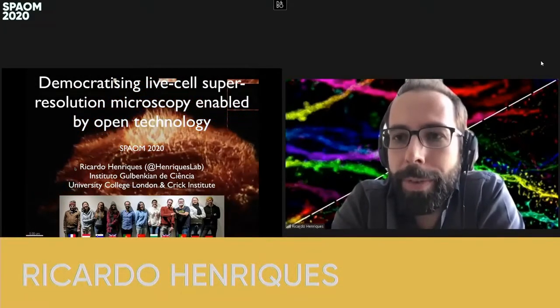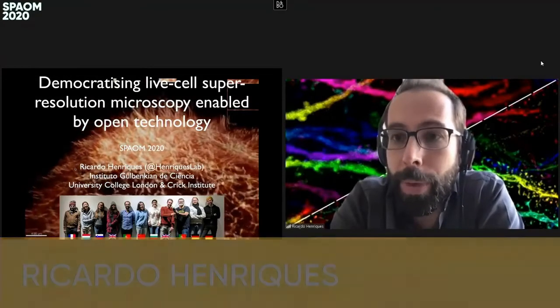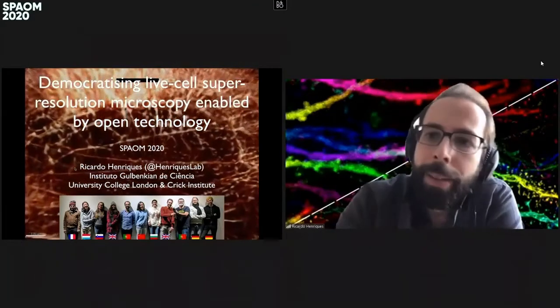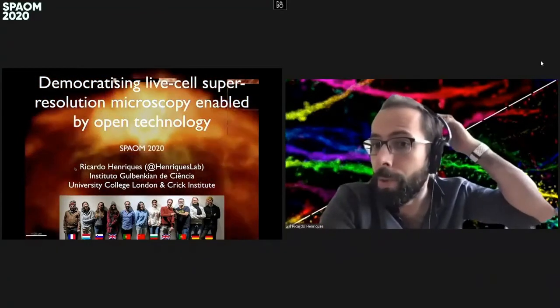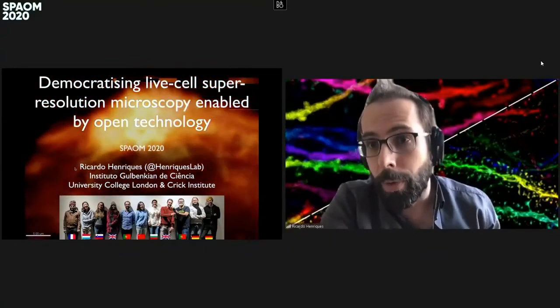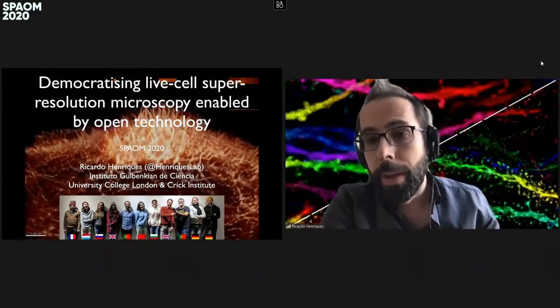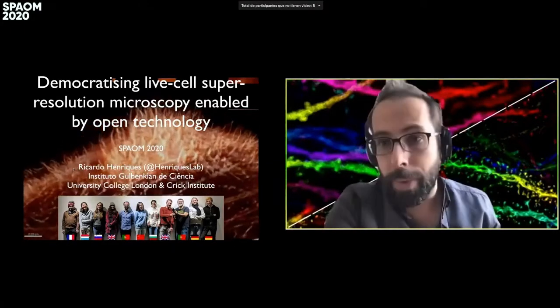I'm going to dominantly focus on telling you about some of the open tools we have developed in our lab, or that we have helped collaborators establish. So the key point I want you to keep in your mind as you look through this talk is that everything that you're going to see is immediately available to you. You can just go out of your lab, and likely, if it's software, it's immediately open for your use. If it's hardware or probes, it's very easy to replicate them.